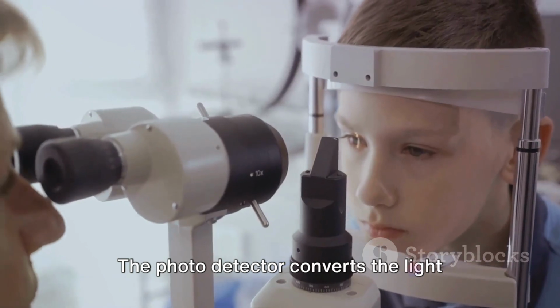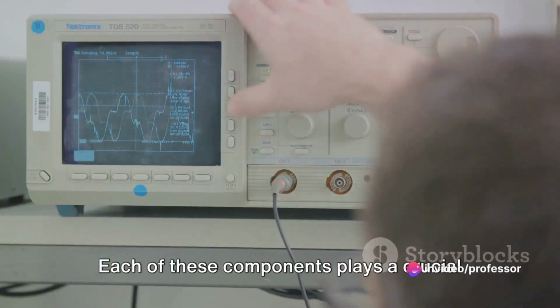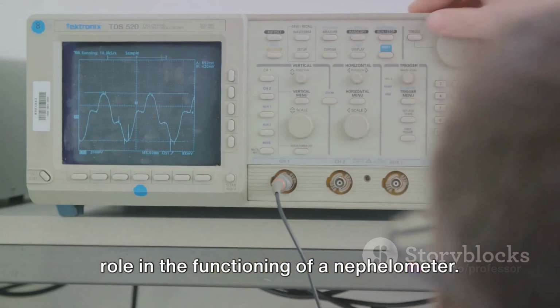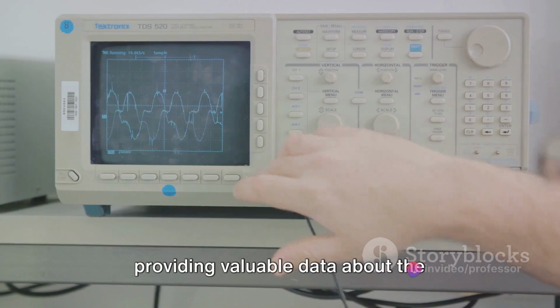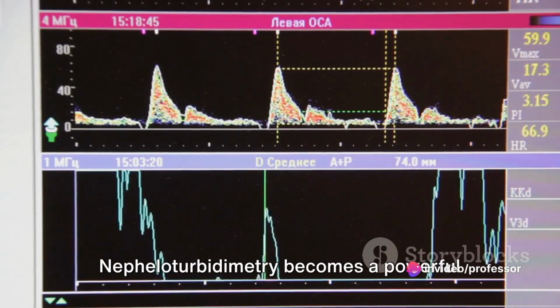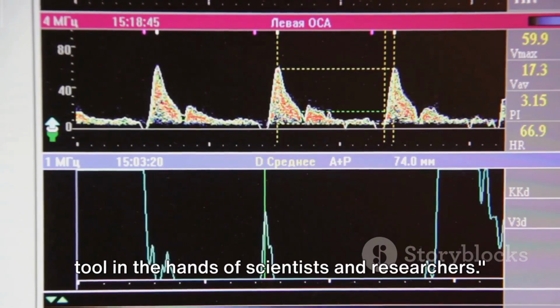The photodetector converts the light into an electrical signal, which can then be processed and interpreted. Each of these components plays a crucial role in the functioning of a nephelometer. They work together to accurately measure the intensity of scattered light, providing valuable data about the particles in the sample. With the right instruments, nepheloturbidimetry becomes a powerful tool in the hands of scientists and researchers.